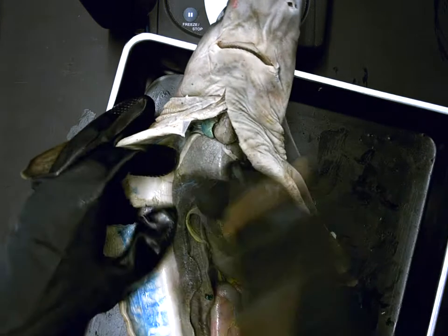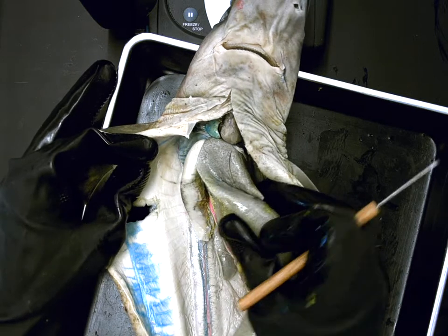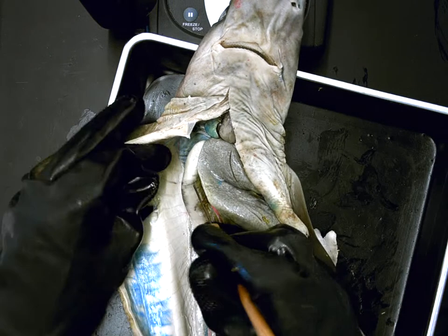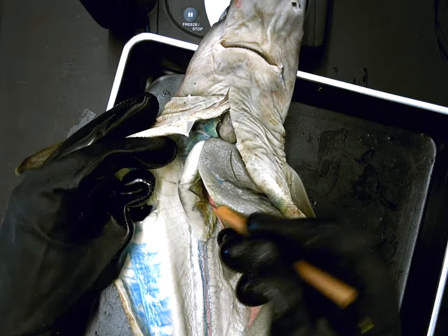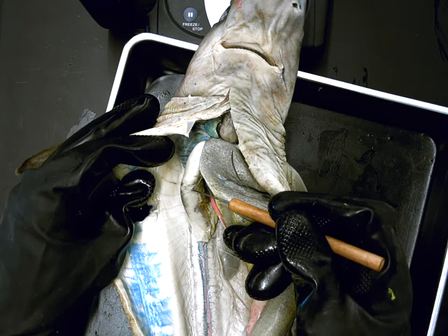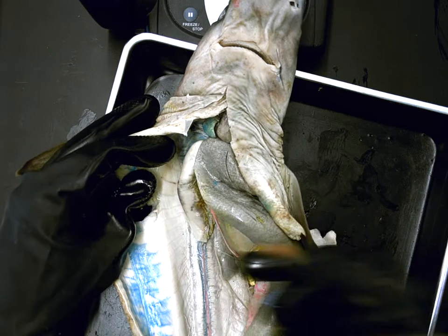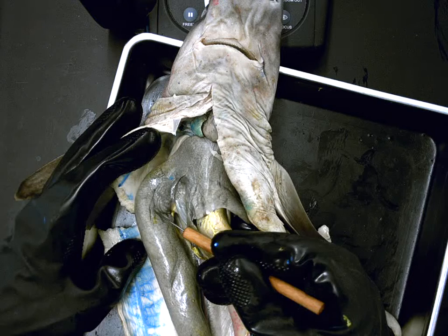okay, if I first grab this dark kind of brown structure and I pick it up, I can see that there's a nice white one underneath. Please tell me, Alexis, what would this be? And two functions? Produces hormones and sperm. Hormones and sperm, correct. Then I put that back down and I stab this big brown structure itself.